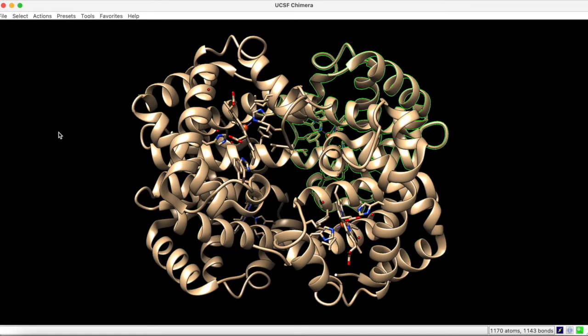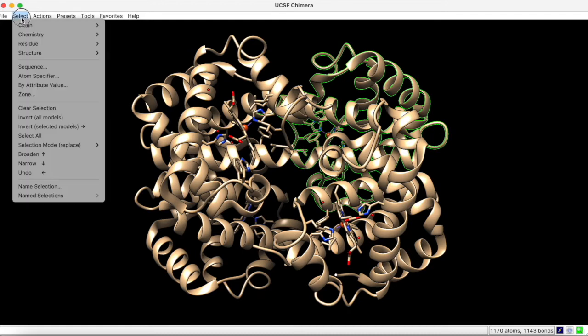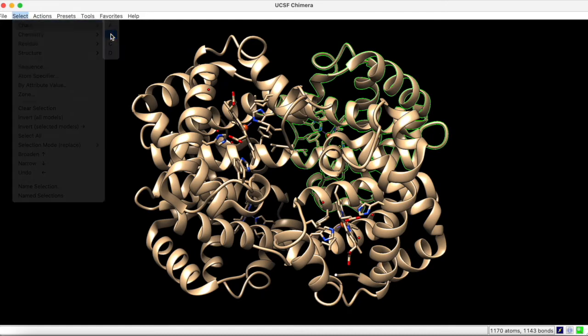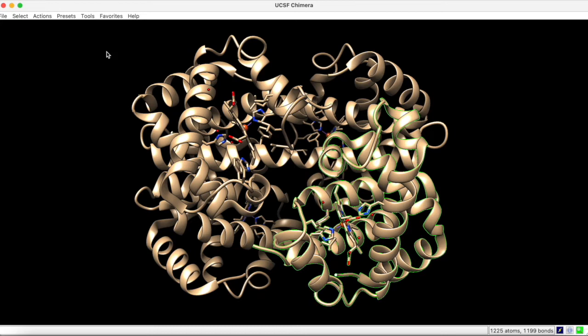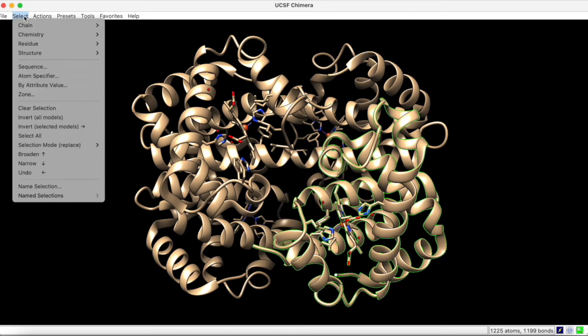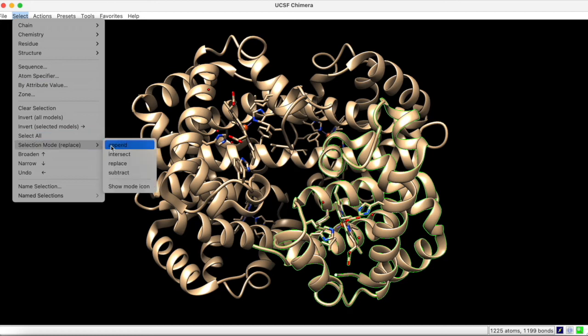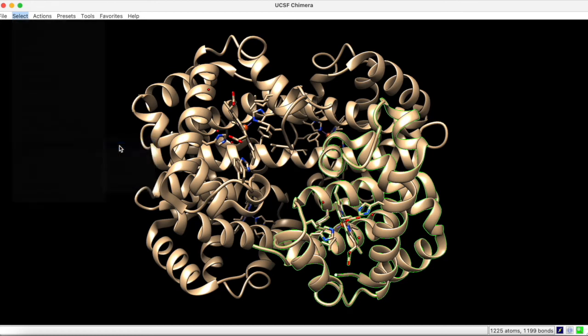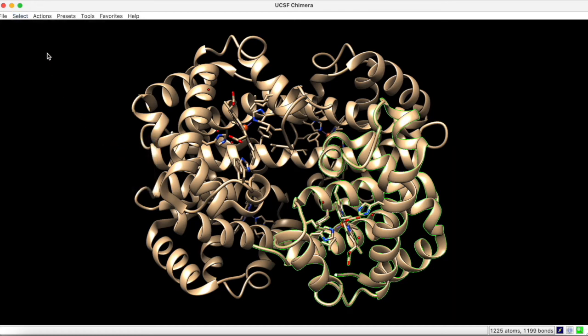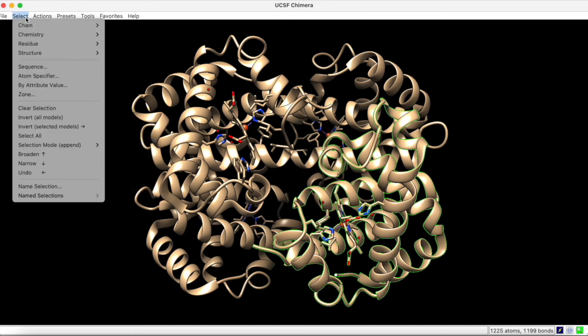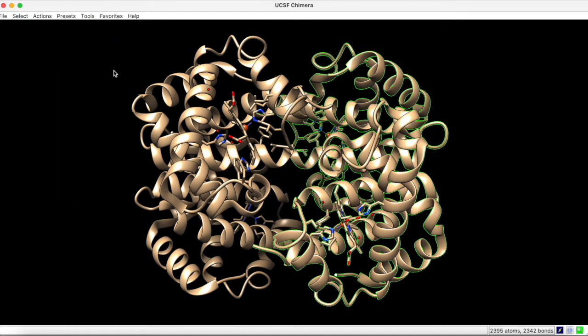Normally, we will have the selection mode on replace. This means that if you select chain B, chain A becomes deselected. However, we can change the selection mode to append. Now, if we select chain A, both chains are selected.